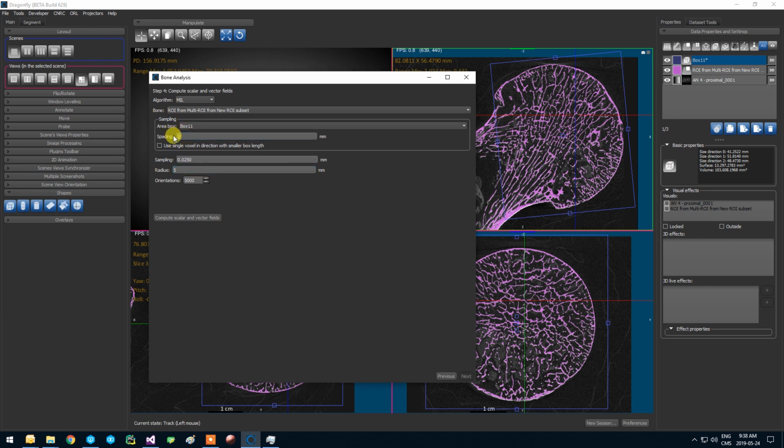If I provide a value that is super dense, like 1 micron, then I will have a factor of 1,000 points. So I will have 41,000 points in the first direction, 51,000 points in the second direction, and 48,000 points in the third direction. So it will provide me with a billion points more, and this will be probably too much for what I want to do.